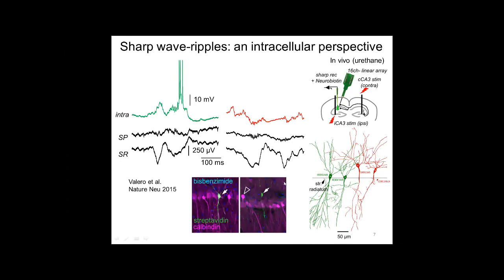And if you combine identification of the single cells here in green, one example, another example, with immunostaining, again, calbindin, a calcium chelator, you can see how cells more likely to be depolarized tend to be located closer to the border and positive for calbindin. However, those cells which are farther away from the border do not express calbindin. This radial organization is related with this axis that I mentioned before that Schaffer suggested.